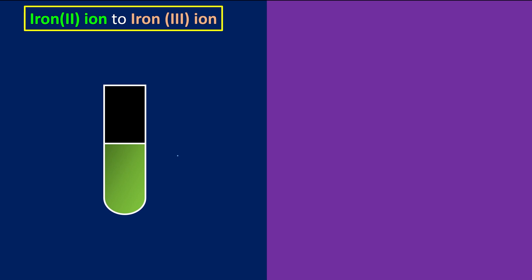Let's look at how we're going to convert iron(II) ion to become iron(III) ions. First, we're going to prepare a test tube that's filled with iron(II) sulfate solution. As we can see here, we're going to have iron(II) ions.